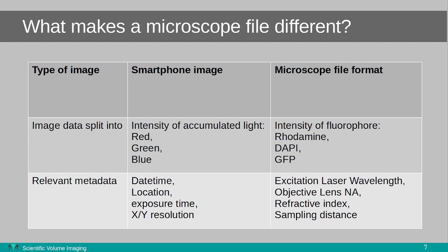Smartphone pictures can have metadata about the location where the image was taken, while microscope file formats often store the information to do with the acquisition, such as the laser wavelength you used, the information of the objective lens that was active during acquisition, and some acquisition softwares can even write tiled series of images for stitching, which requires information about the position of the microscope stage.